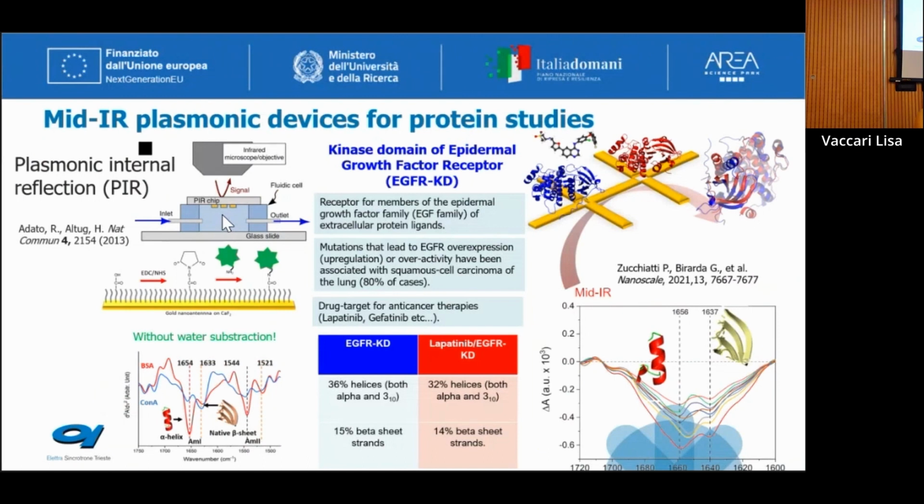So there is a long way to pursue, but I think it's very interesting because it could help, for example, to understand how some variants are maybe more effective than others, or what is the effect of temperature in the infection, because temperature means a different type of flexibility of the things, and maybe things that we cannot imagine at this stage. So this is one example.